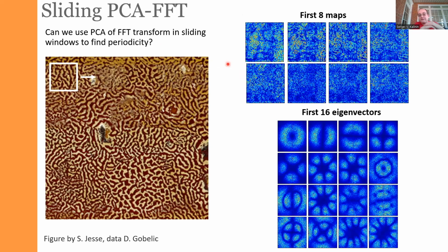And the beauty of it is that if you start to apply this type of method for any image, you start to get something really interesting, which actually makes you think about the deep relationship between the statistics and physics. So this is an example of the scanning probe microscopy image, which shows some preferential domain pattern. So for simplicity, it is something like a spinodal decomposition.